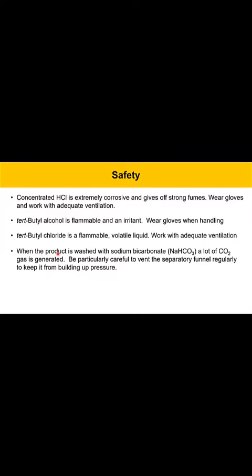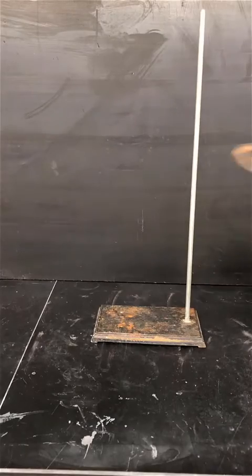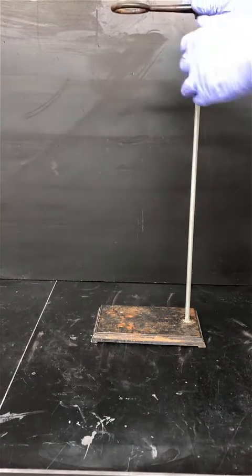After the reaction is done, we're going to wash the product with sodium bicarbonate to neutralize the HCl in the reaction. That process produces a lot of CO2 gas. The issue with that is that the separatory funnel can build up pressure if you're not careful, so you want to vent the separatory funnel regularly. If you forget about this step, the top could blow off of the apparatus and liquid could splash out.